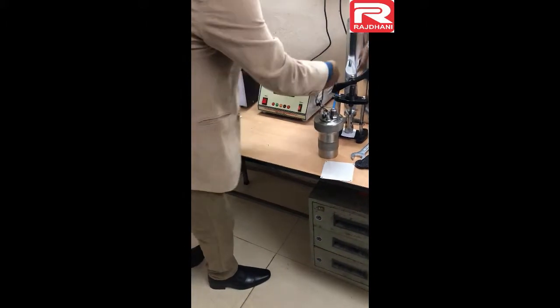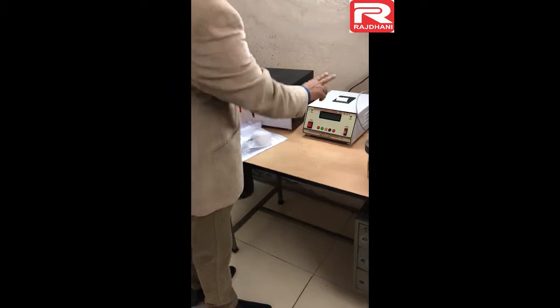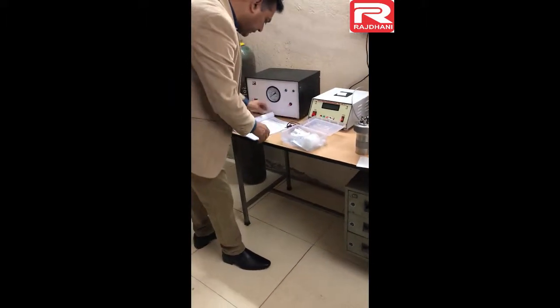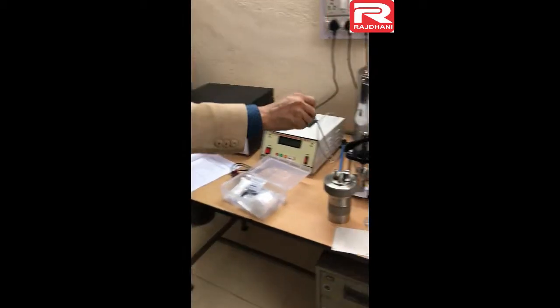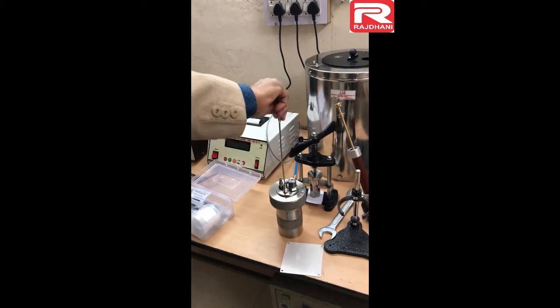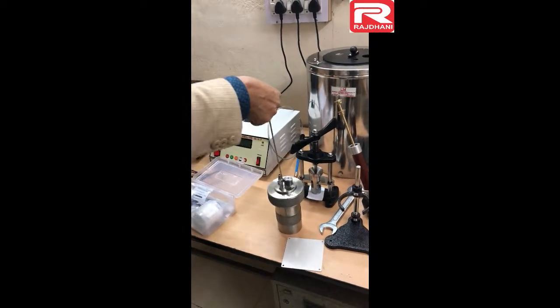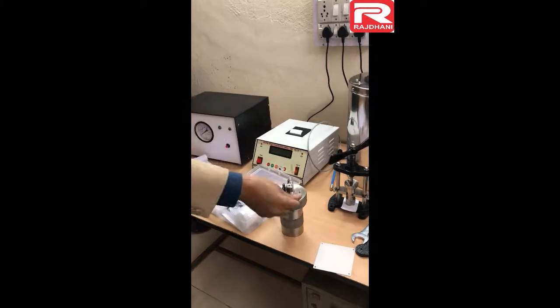The main purpose of this lead is to provide a path for the current to reach from the digital unit to the ignition wire. The next accessory is the hook. This hook is used to lift the bomb — this is the bomb-lifting hook.